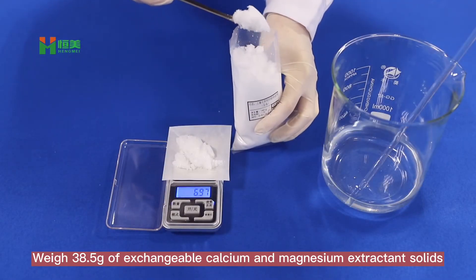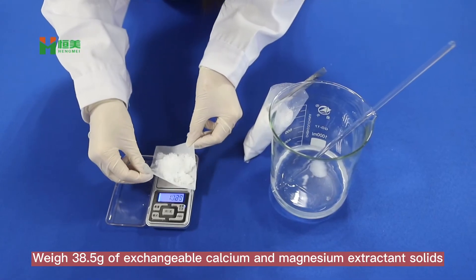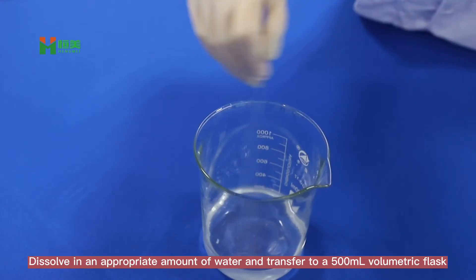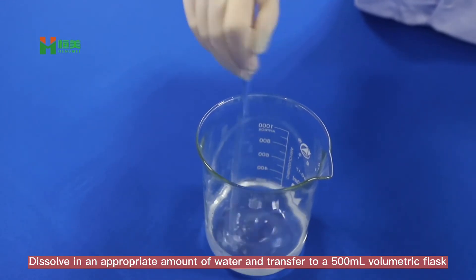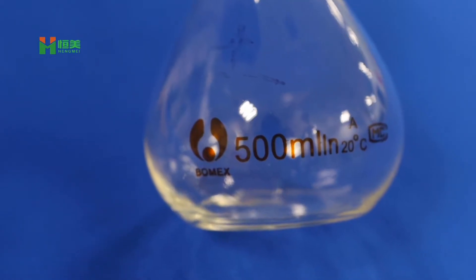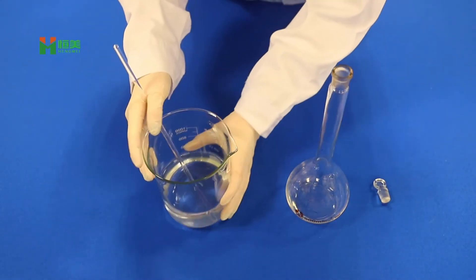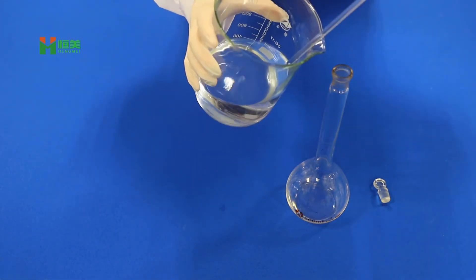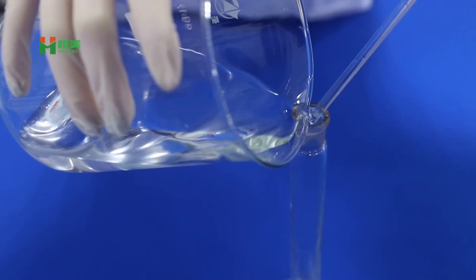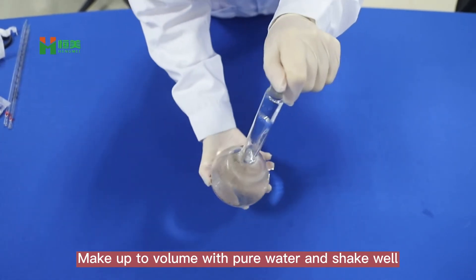With 38.5g of exchangeable calcium and magnesium extractant solids, dissolve in the appropriate amount of water and transfer to a 500ml volumetric flask. Make up to volume with water and shake well.